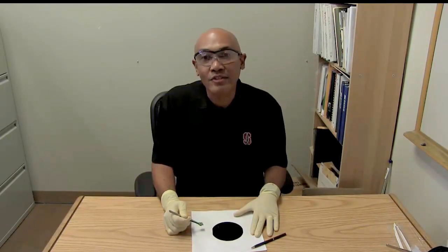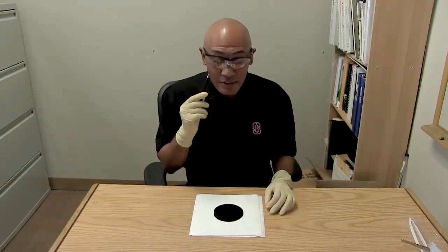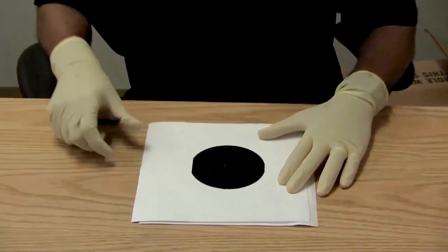It's time to cleave a wafer. I've got my safety glasses on and my wafer sitting in the middle of a pile of lint-free towels, which is going to give us some cushion.